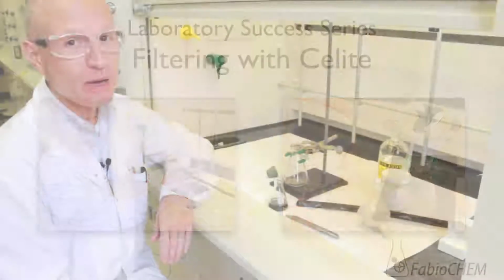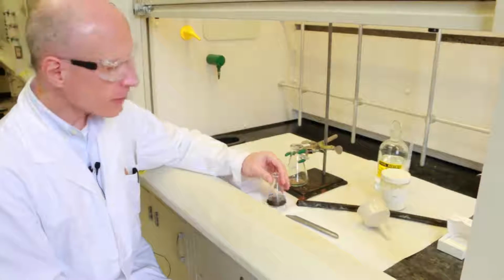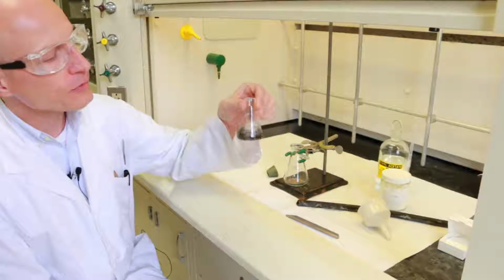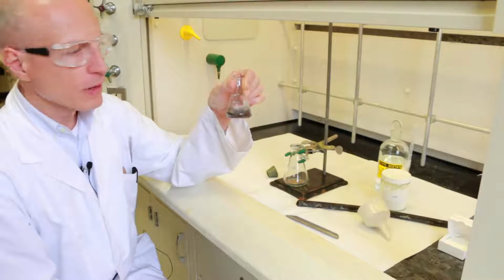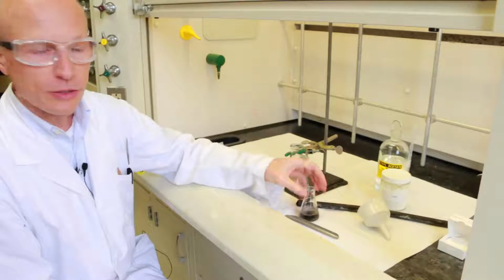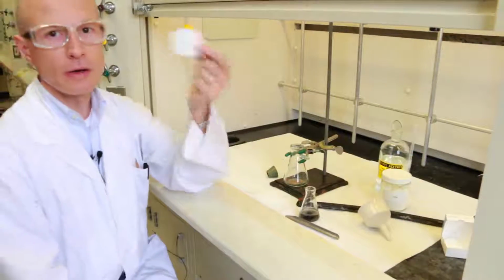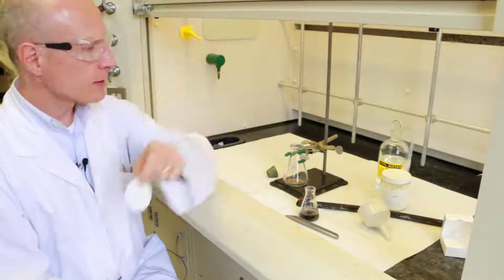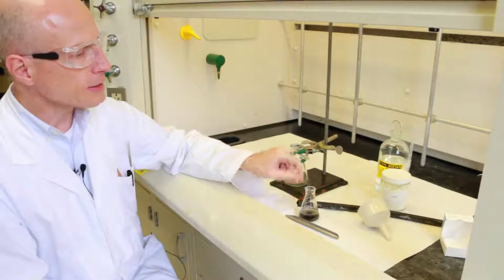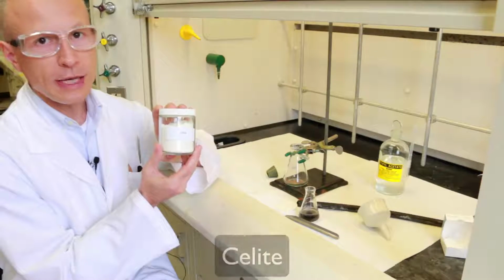Today we are talking about filtration through Celite. It happens fairly often in the organic chemistry laboratory that you have to filter off a very fine particulate from a solution. Sometimes the particulate is so fine that it would go through the pores of your regular filter paper, so you need to use a filtering aid. The most common filtering aid is diatomaceous earth, normally called Celite.